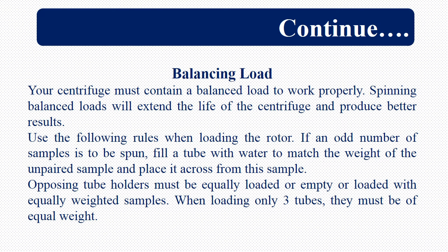If we have a sample that we need to centrifuge but another sample is not available, then you can add another sample of that weight. The difference is that which sample is to be centrifuged will be centrifuged, and the other will not be centrifuged. If you normally have even number of test tubes, place them in alternative positions. If you have odd number of test tubes like three, then they must be of equal weight.